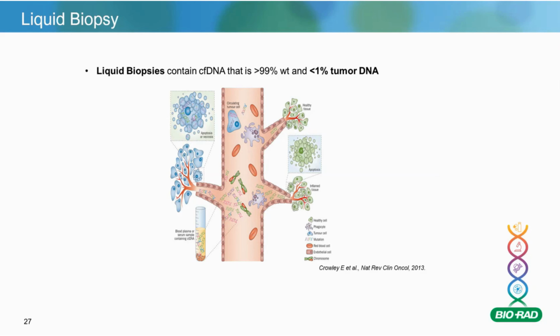And then if we talk about this liquid biopsy, which we briefly touched on as well, just that fact that it's a largely non-invasive procedure and it's more representative of the overall body rather than a biopsy of a tumor in a single location. And also, multiple biopsies over time are impractical, expensive, and are dangerous for patients.